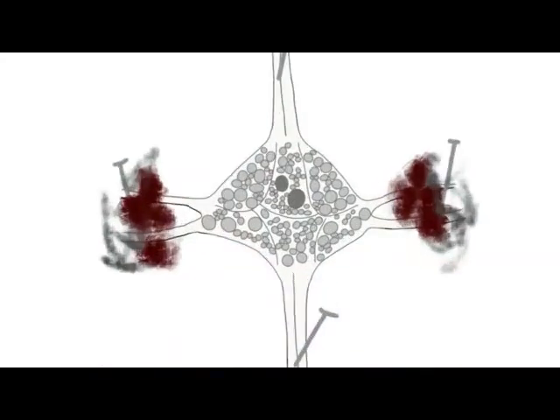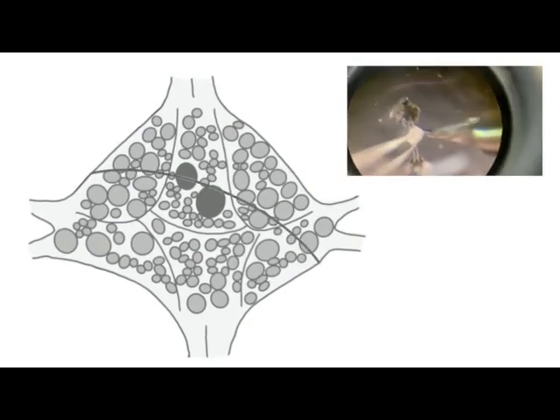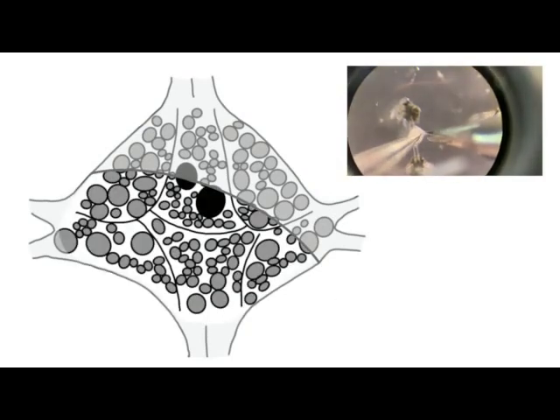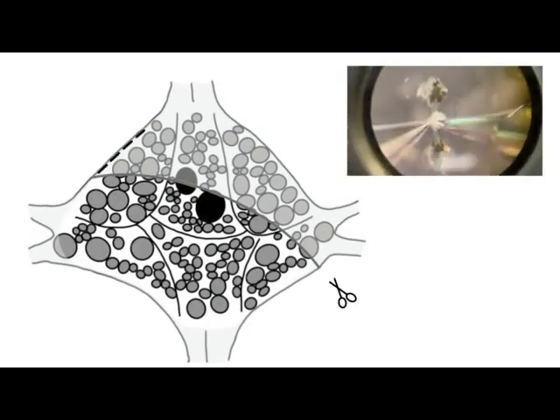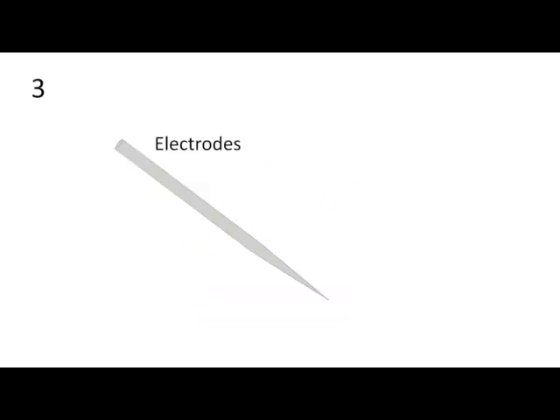After the ganglion is pinned we need to remove the glial sheath, because this sheath prevents the dye molecules from binding into the cell membrane. To disheath the ganglion we carefully lift the glial layer and cut across the entire ganglion. Then we cut along the edge to remove the first half of the glial layer and expose the underlying cells. We repeat this step with the other half of the glial layer. To record intracellularly we need electrodes.